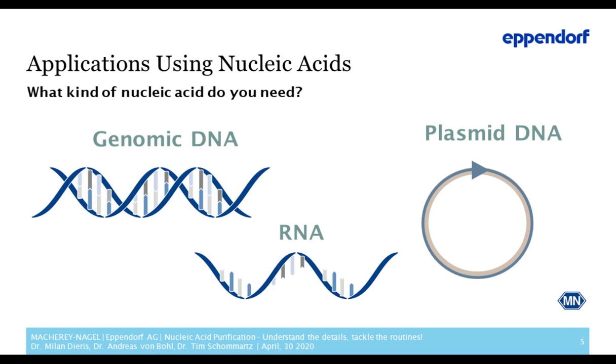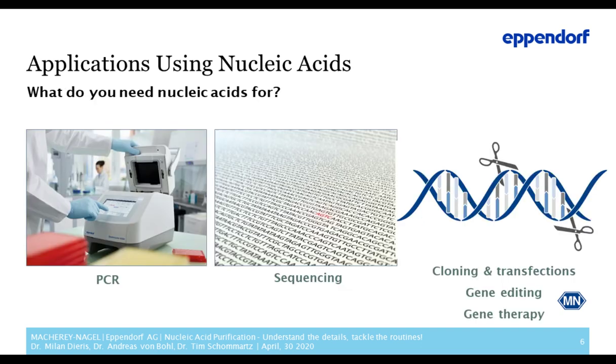And when we look, for example, at plasmid DNA, you should always keep in mind that plasmid DNA is usually derived from bacteria. Bacteria don't only have plasmid DNA, they also have genomic DNA. And the method to separate those is the lysis, basically. Plasmid DNA kits usually use an alkaline lysis, which just perforates the membrane enough to release the plasmid content of the cell, and the genomic DNA stays inside the cell remnants and can be pelleted by centrifugation. So each and every kit has special buffers, special chemistries to fit your purification workflow.